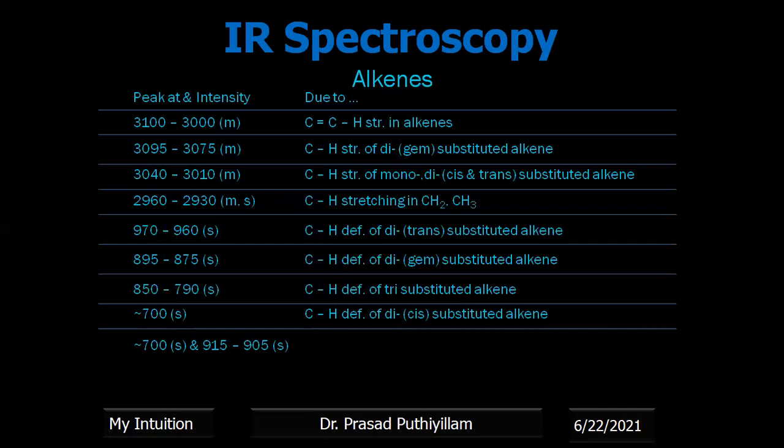Along with that, a peak at around 915 to 905. That is also a strong peak if it is a mono substituted alkene, the CH bending deformation of mono substituted alkenes. Okay, so based on the different alkene that we have, we can expect these types of bands.